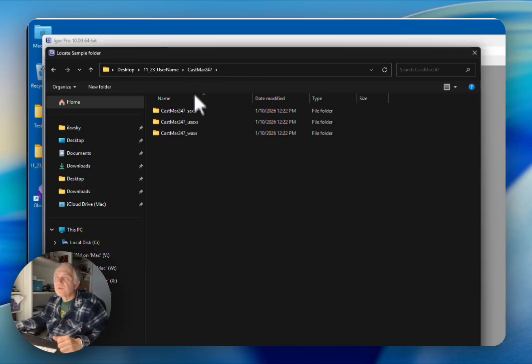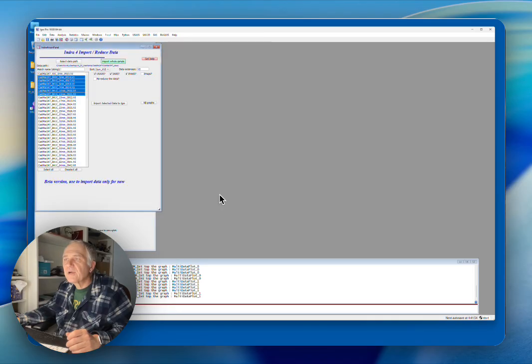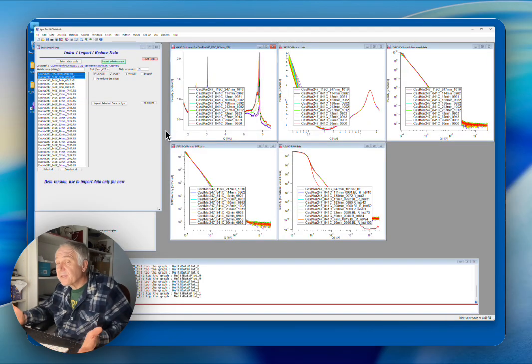This time, if you want to do that, you don't point on a segment, but you select the folder which is above. So you now select the folder which contains the 3 additional folders. You select the folder, and the code is just going to go in and look inside each one of those subfolders and import all of the data. That may take some time because it's reading a lot of data, and then it replots them immediately. And now you have all the data at once.